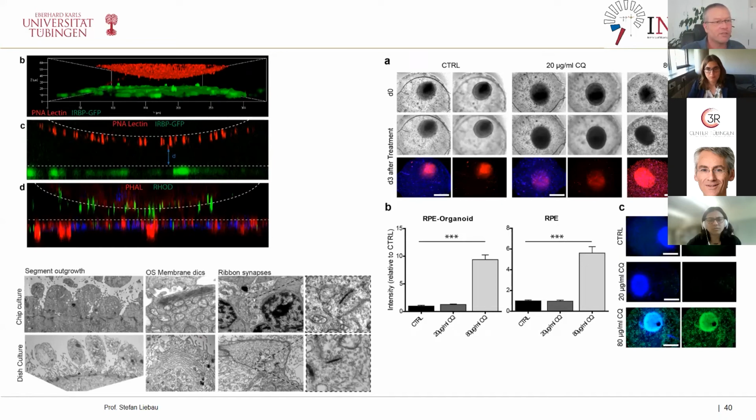And what we also saw is that the RPE cells, which should traffic the outer segment, so they are always phagocytosing these parts of the photoreceptors and helping to renew them, that our RPE layer is able to really take up these outer segments from the photoreceptors from the organoid. And probably it's a bit too small here, the ultrastructural level, and as I said, there are so many shearing forces in the normal media chamber. And we also were able to see that the outer segments had a really better ability to grow, and also the number of outer segments was much higher in the chip.